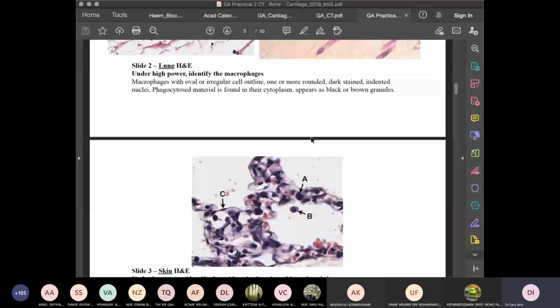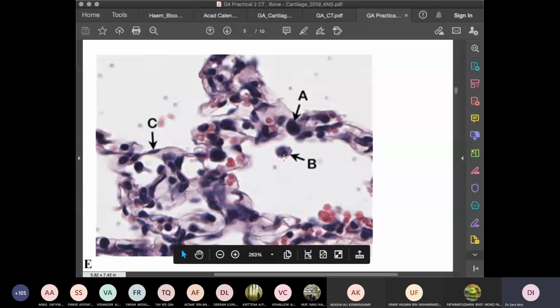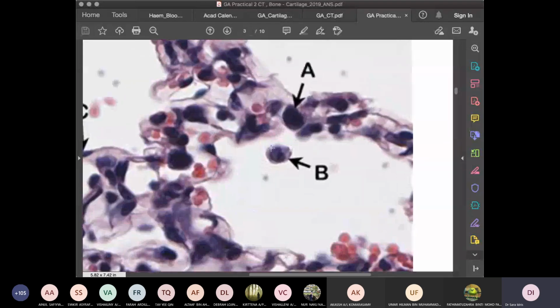These are all the parenchyma of the lung. Okay, and you can see the red color here. These are your blood vessels, the red blood cells. And here in the alveoli, you can find one macrophage. It can be this shape, it can be a different shape, but the nucleus is there, and if you were to have a clearer picture, you could zoom in a little more and see phagocytosed material in there. So this wandering cell comes because it can find pathogens. They are supposed to look for pathogens, and they're called upon there, and they will phagocytose the cell.